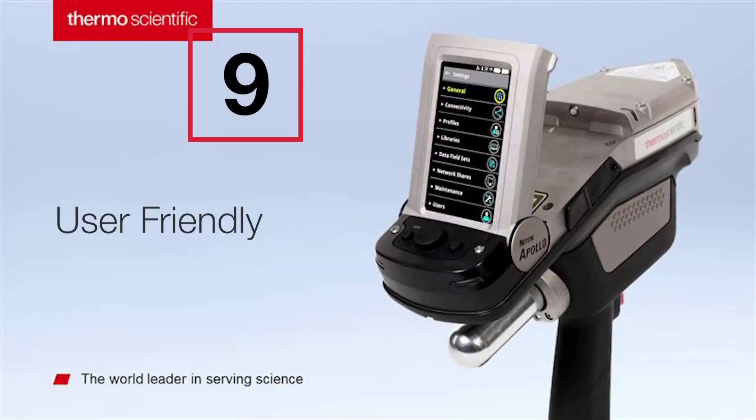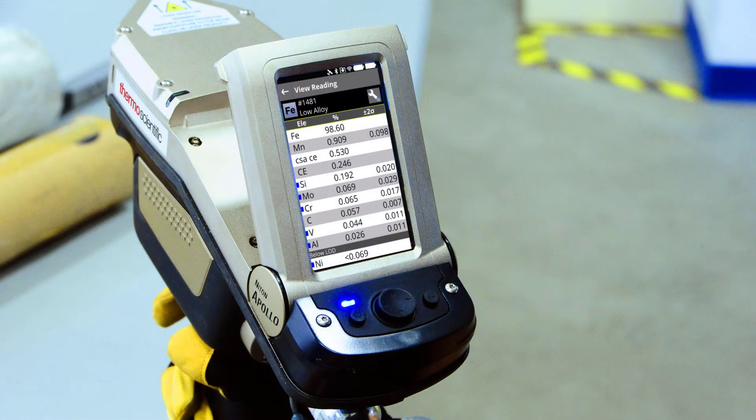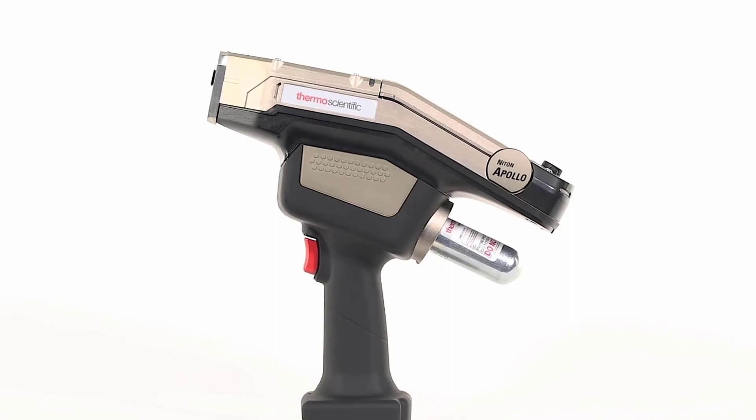Made user-friendly, a tilting color touch screen and navigational keys ensure easy navigation without removing your protective gloves.